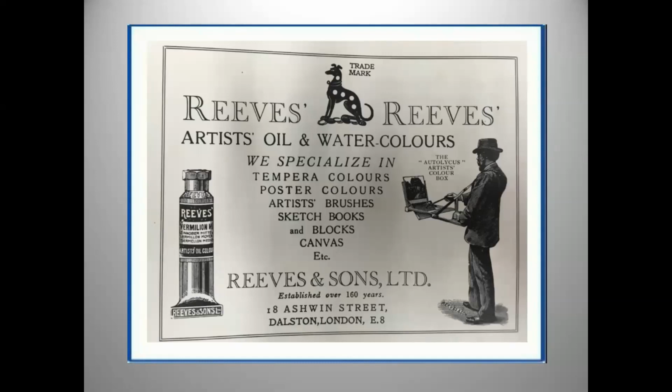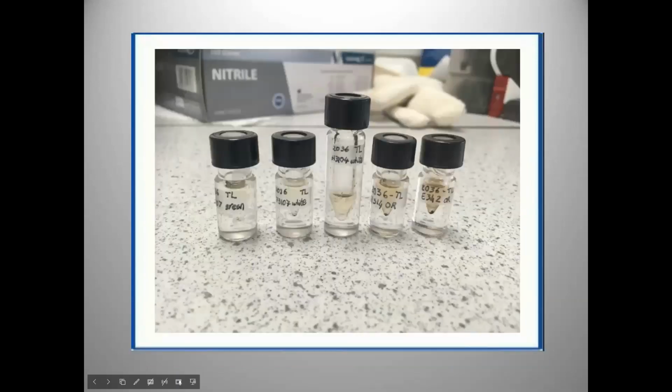Chapter 3 will describe the observational data obtained from several photomicrographs of Sims' works on paper. This will have informed the location of subsequent FTIR, ATIR, Fourier transform infrared attenuated total reflectance analyses, and thus further GCMS, which is gas chromatography mass spectrometry. The methodology, limitations, and results of the scientific analyses will be interpreted and explored.